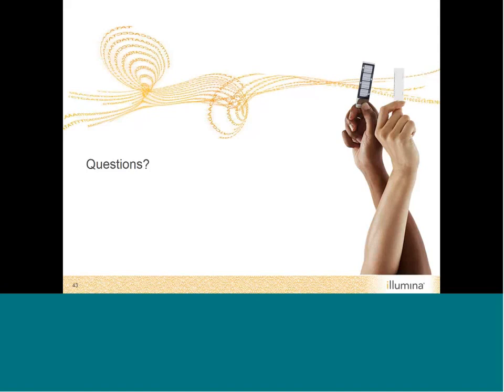Okay. What controls should I consider when running any of the Amplicon panels? When it comes to the controls, the important question is, what type of control, right? For the TruSeq Custom Amplicon, for instance, there is a control DNA and a control oligo pool provided in the kit. This is something that you can use to just test your library prep itself, right?